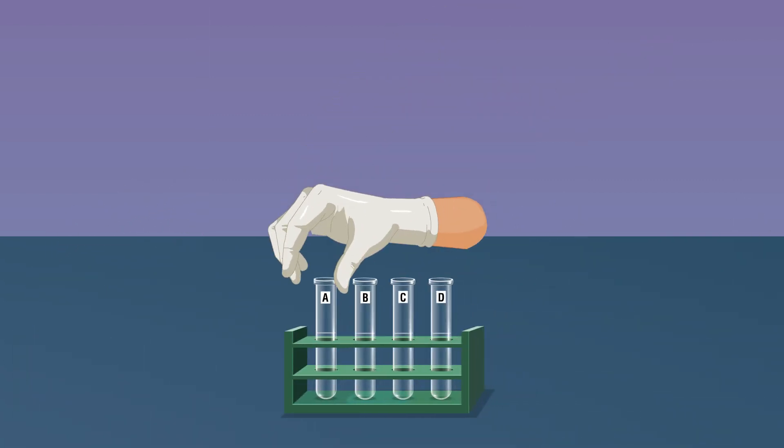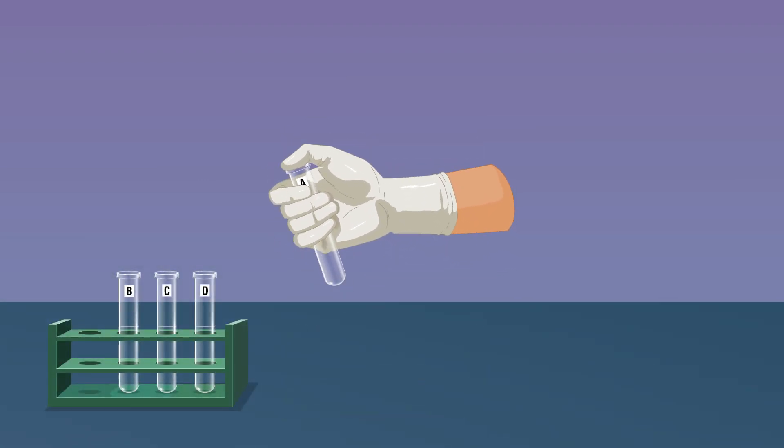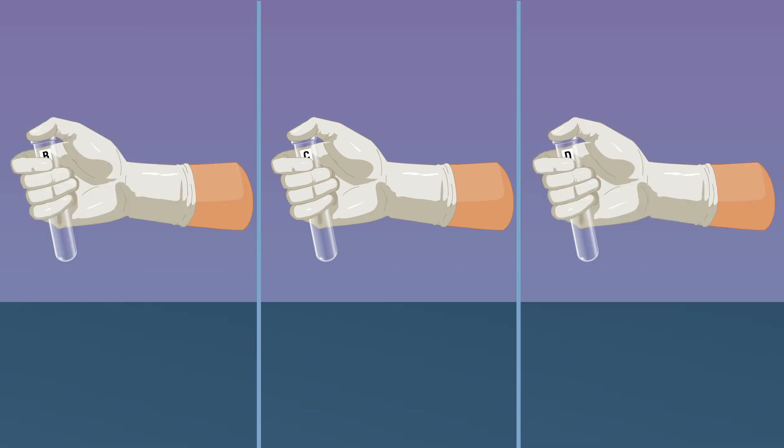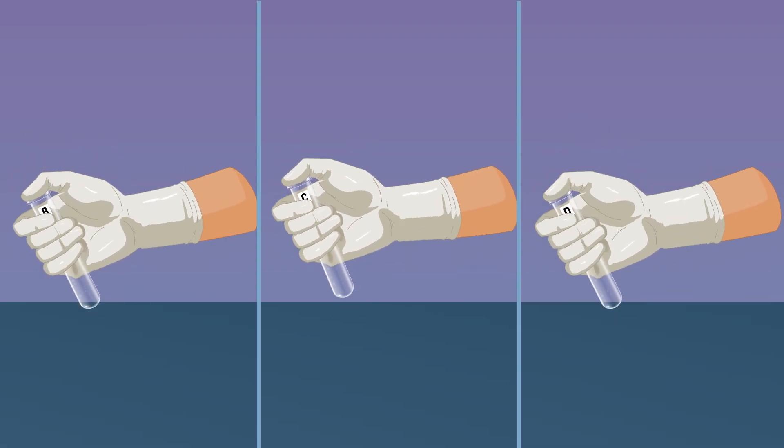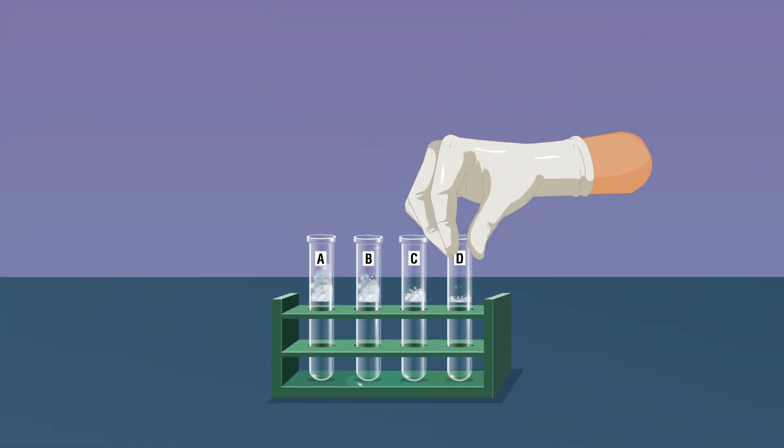Take the test tube labeled test tube A and shake it 10 times by placing the thumb on its mouth. Repeat the steps with the remaining three samples of soap solutions. By shaking the test tube will form the foam.